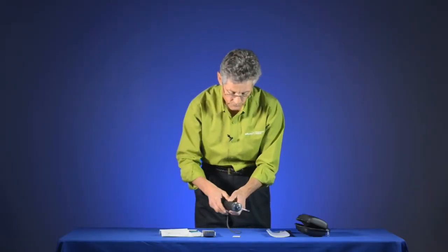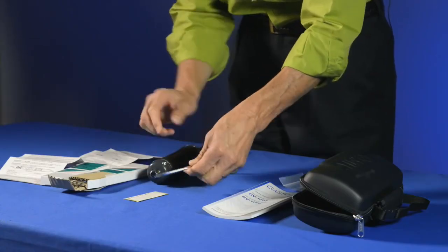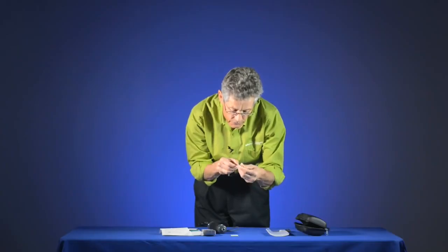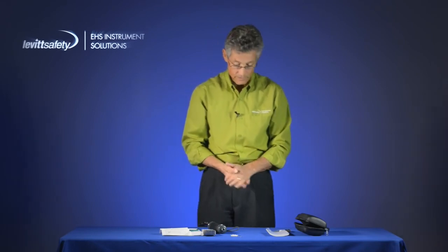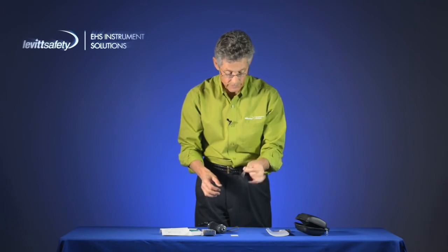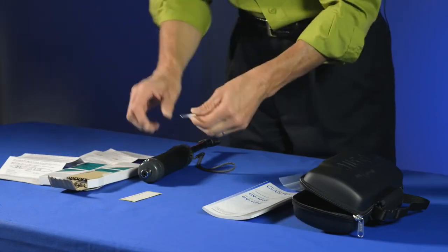Once the pump stroke is completed, remove the tube from the holder. The GAS-TEC tube now reads a concentration of about 1,000 parts per million, so we know with confidence that the concentration of carbon dioxide is 1,000 ppm right here and right now. That's how you use the detector tube system. The used tube can be disposed of, and you can take another sample in another location if needed.